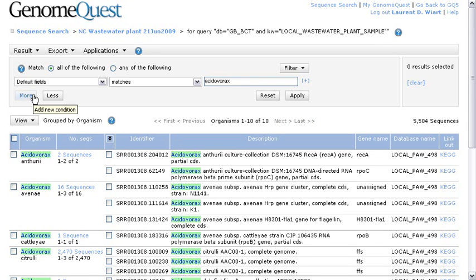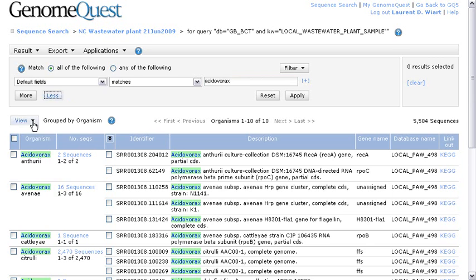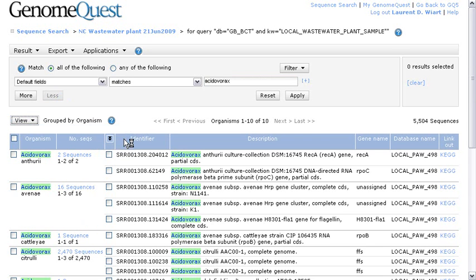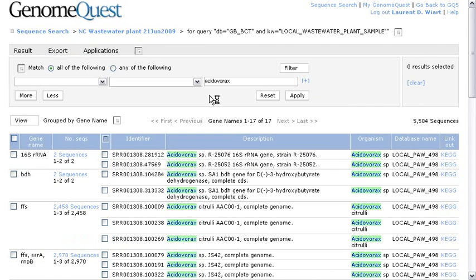So now, we have refined to drill down into the acidovorax reads. And we could go farther. We could decide to select on a few gene names or even group by gene name. In this case, we could do that. So let's take the gene name and group by this field.